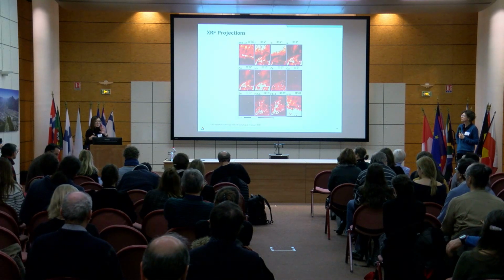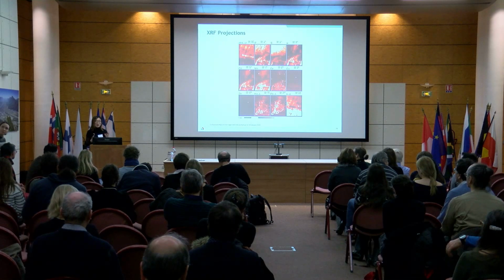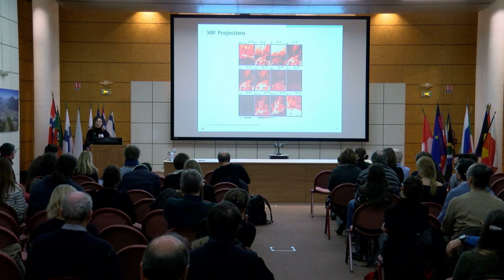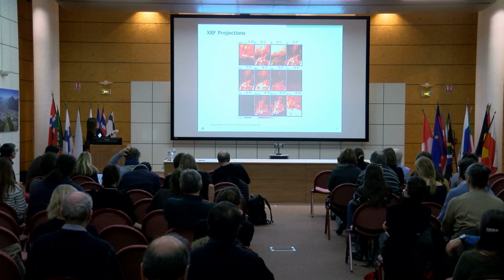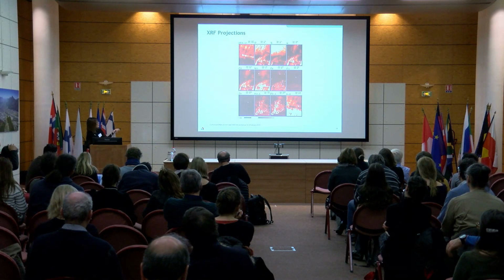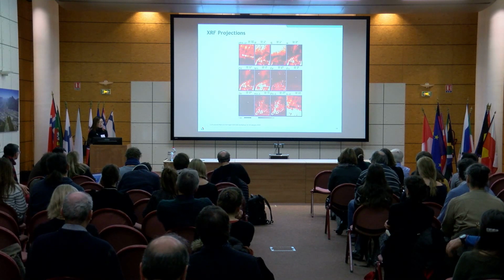I want to make a comment on the previous talks. I remember the audience asked: is it possible that this ink contains lead phosphate? In this case I don't see anything in the sulfur, except that it looks like a surface structure. But again, with X-ray fluorescence tomography, we have the self-absorption issue.